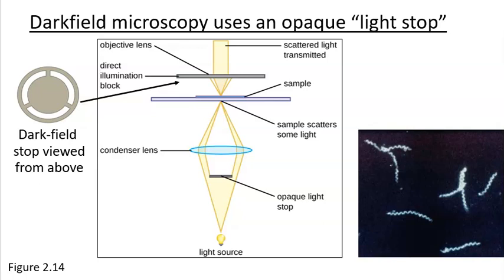What happens with this dark field microscope, as you can see from this image, is you actually have a dark background, and your cells are the ones scattering the light, which allows you to see them and gives you contrast against the background. This is really good if you think about it. If you've got a transparent cell, you're not relying on it refracting the light in order to see against a bright background. You're getting the refracted light because that's the only thing doing it, and everything else is dark.